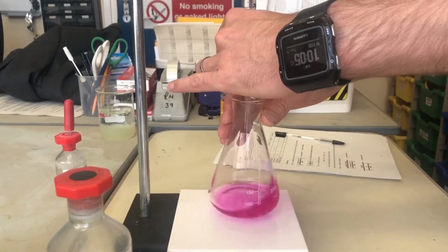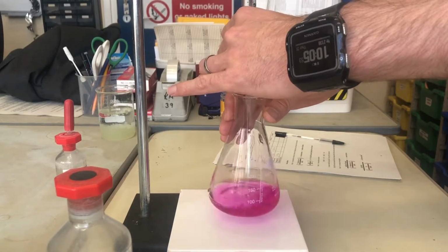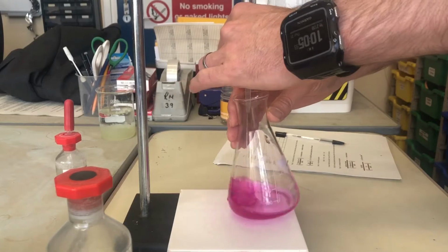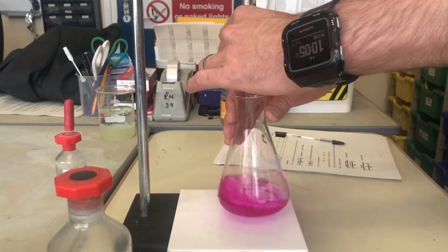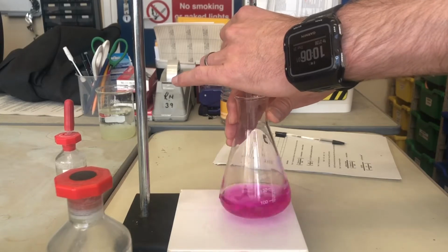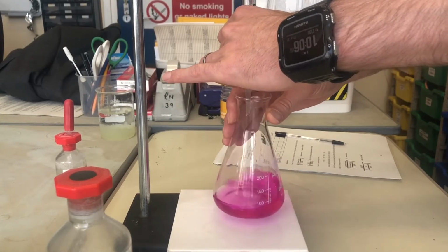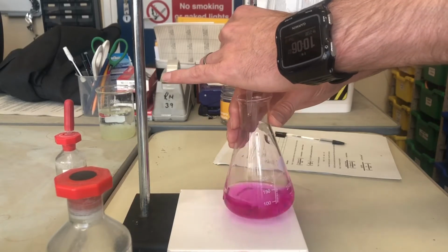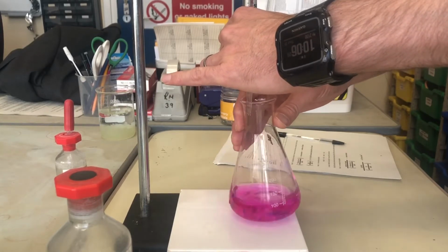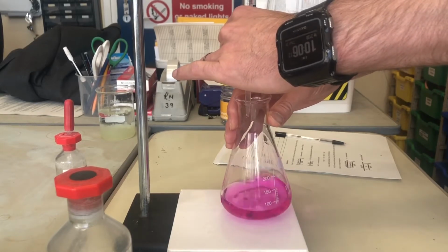I'm going to quickly run in, well slowly I should say, some acid to that while swirling all the time. The swirling keeps the reaction going, makes it happen nice and quickly. I'm going to slow it down a little bit now so we're getting closer to the neutralisation point until we eventually go drop-wise in a moment. So I would expect the neutralisation point to be quite soon, so I'm going to slow that down even more.